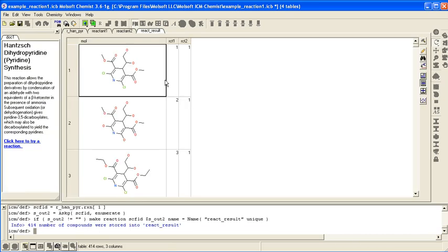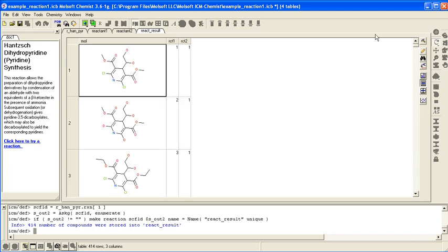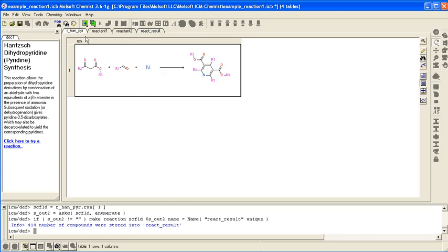And you have a new database of compounds based on this reaction.